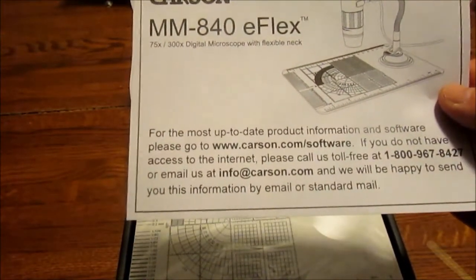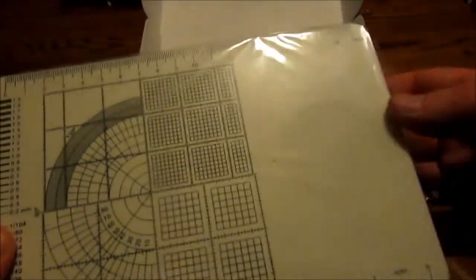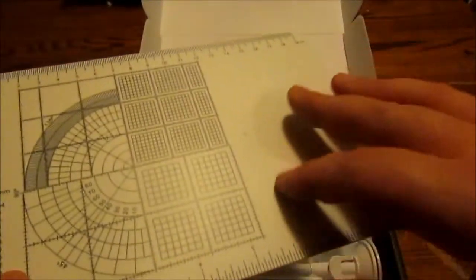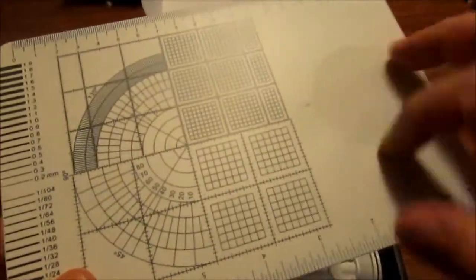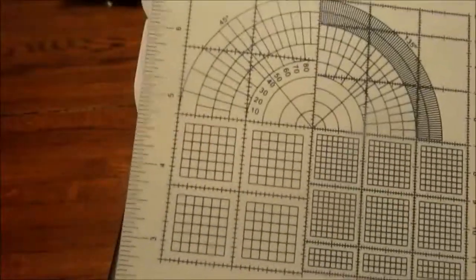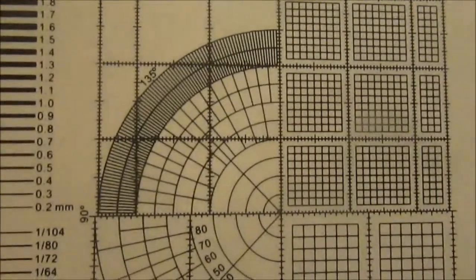There are some software update notes — pretty self-explanatory. Looking at the unit itself, I don't know if you guys can see that shimmer, but it looks like the base is made out of a separate material, probably for the suction cup. It's a smoother, non-porous type of feel. The body has kind of a coating on it, which isn't present here. You can see some mill lines for calibration — it gets down pretty small.